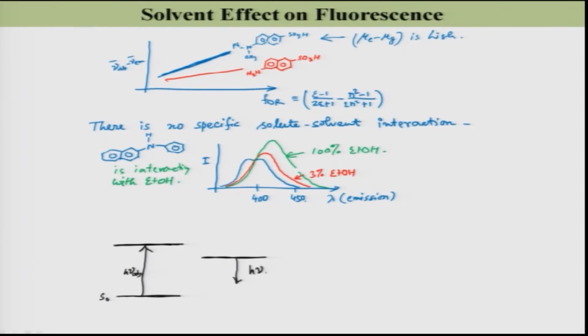Now, coming from this state to this state, there will be a numerous number of steps depending on the specific solvent reorientation around the solute dipole.